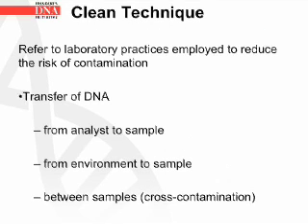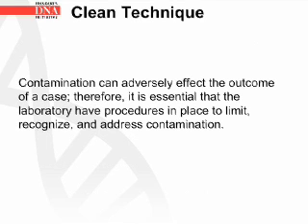Let's go over clean technique. This refers to the laboratory practices employed to reduce the risk of contamination. One type of contamination is the transfer of DNA. This can occur from analyst to sample, from environment to sample, and between samples, which is known as cross-contamination. Contamination can adversely affect the outcome of a case. Therefore, it is essential that the laboratory have procedures in place to limit, recognize, and address contamination.